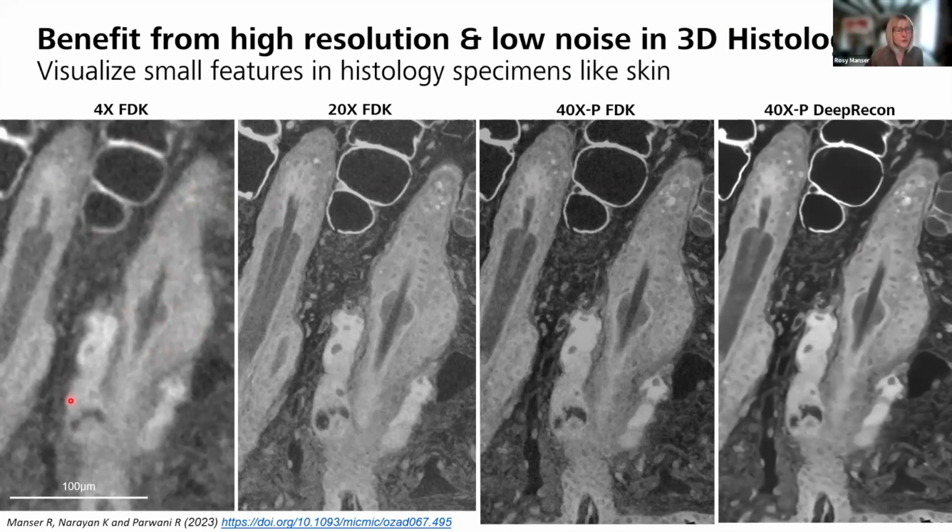Large field of view, but you really don't get to see all of the details of the specimen, particularly because the region of interest was kind of down here. Being able to look at the morphology of the cell groups that you found here was what was most interesting to this researcher. And unless we pushed the system to the limits in terms of resolution and signal to noise, we just simply couldn't see it.